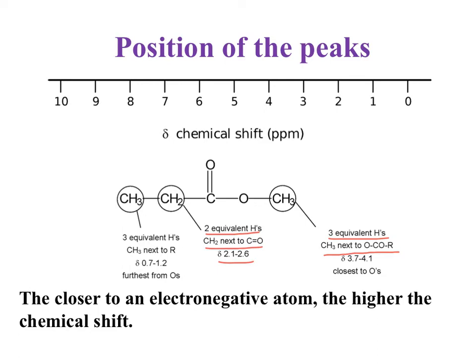And if I go then to our data, I can see that between 2 and 3, that is a proton that's beside a C double bond O, like we would find in a ketone. Yours is listed as between 2 and 3. The chemical shift data here is just a wee bit more exact, but you would use what you get on the back of your periodic table.